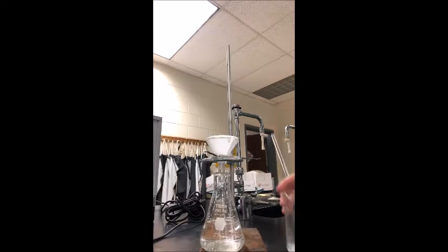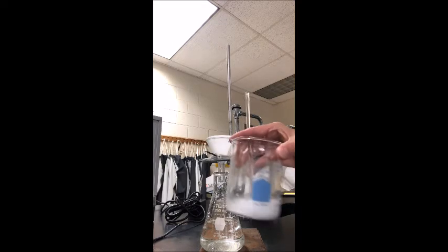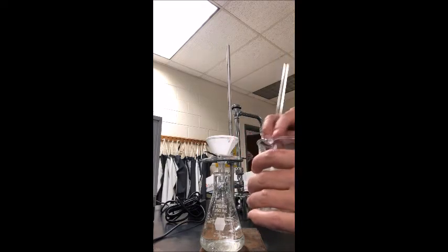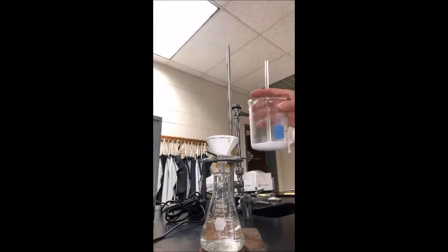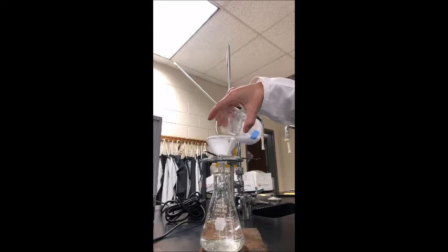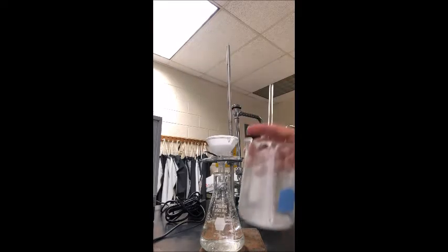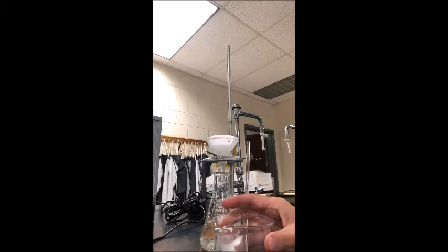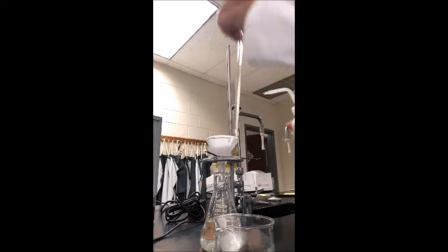Okay, now as you can see, we're down to our little bit at the bottom here of the precipitate. So I'm going to swirl that really good, use this so it becomes nice and milky white. Then I'm going to filter the rest of that in there. Pour that in there. Now, of course, some of the residue is going to stay in the beaker, so I do need to wash the beaker a few times and also filter that because we want to make sure we transfer all of it into our funnel.